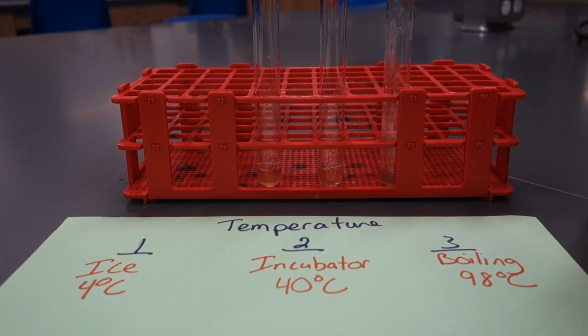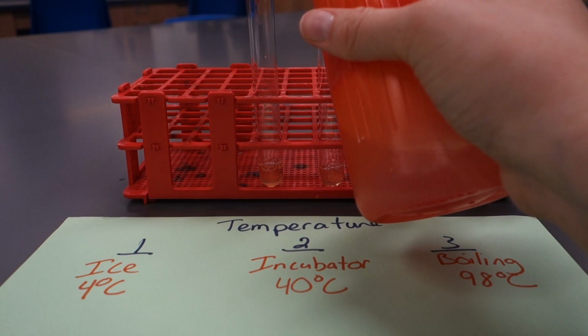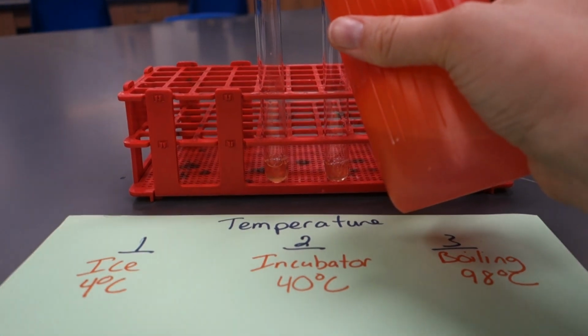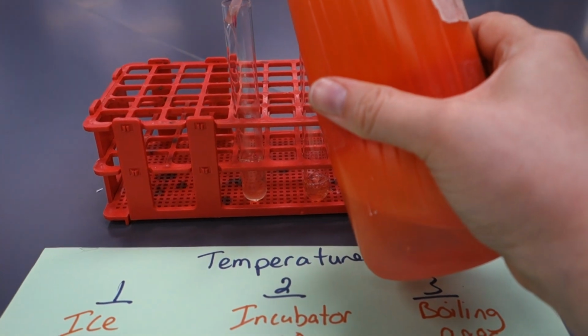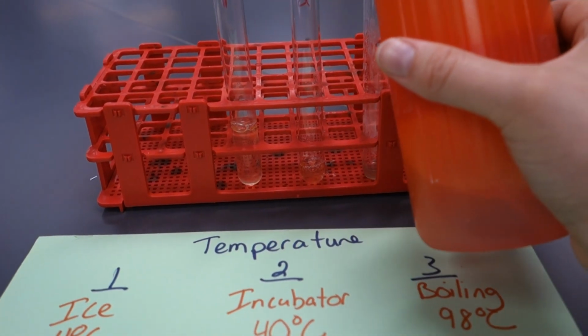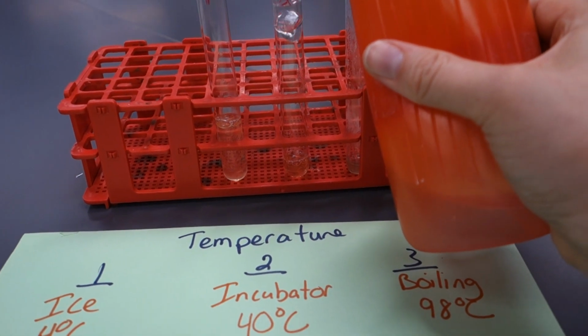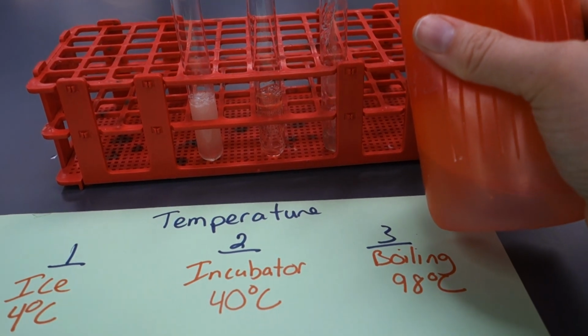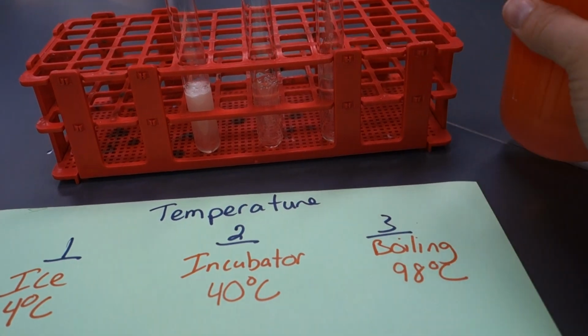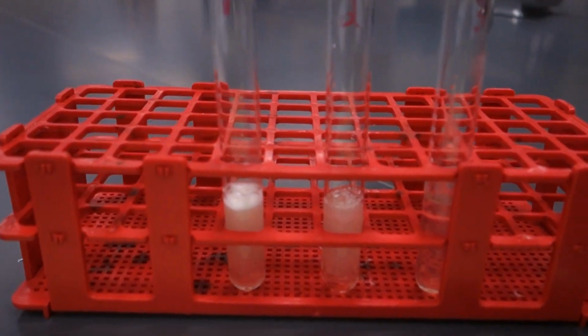How does temperature affect these enzymes? So we'll start with 1. So I'm going to add in a couple mils here. Test tube 2, I'll add in a couple mils here. Test tube 3, a couple mils there. All right, and we're gonna see what happens.